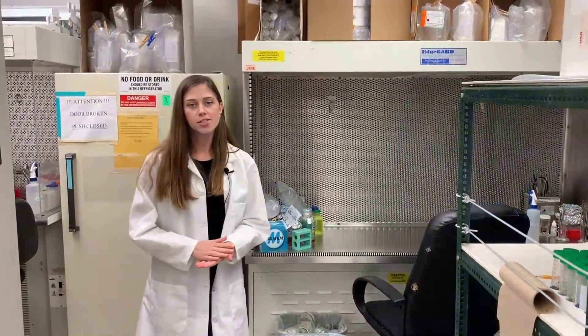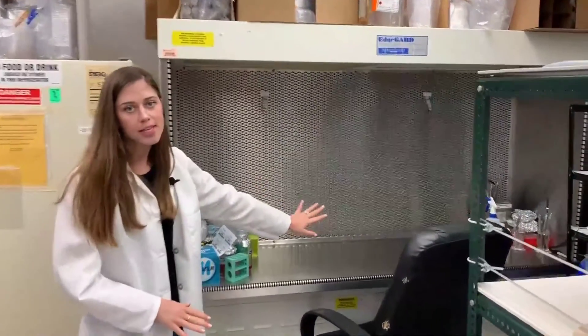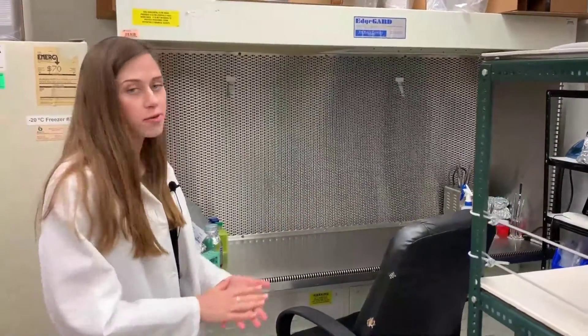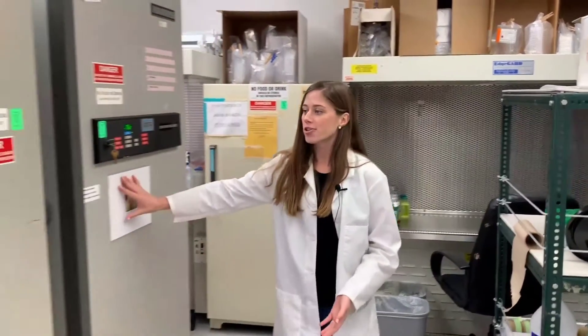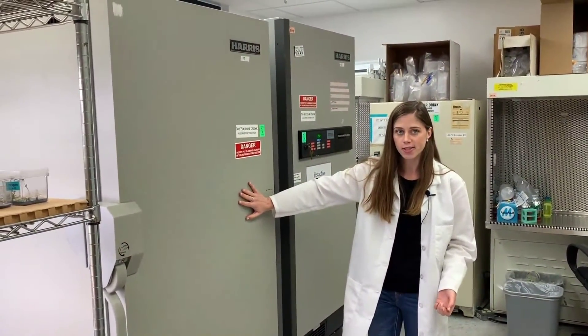In here is our tissue culture and bacterial systems room. Here's our hood, where we keep everything aseptic and clean in order to work with bacteria or with very sterile samples. Here are two of our really large negative 80 degrees Celsius freezers, which we use for more long-term storage of DNA or different tissue samples.